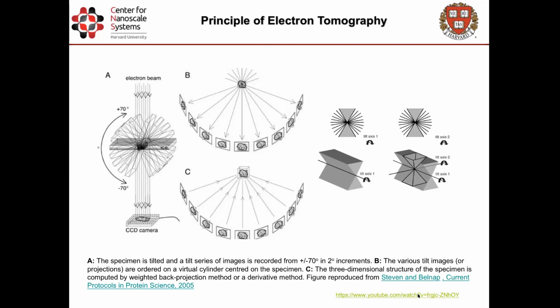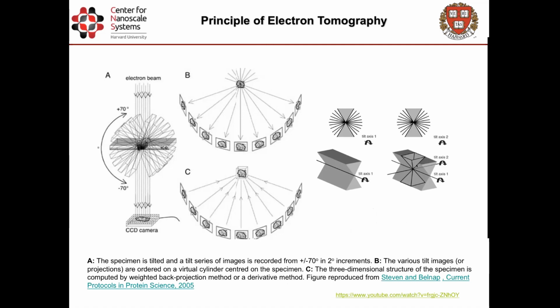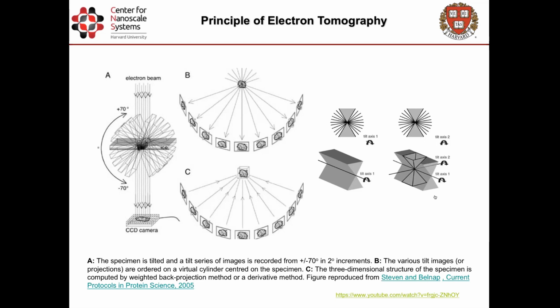This is from the Diamond Light Source, which is pretty much the synchrotron in the UK, in Oxfordshire. It's a comparison here to the SLAC in Stanford, and it tells you how cryo-electron tomography works, and everybody agrees that this will be the next revolution in cryo-EM. But for the moment, we do need to get very thin cryo-lamellae in Cryo-FIB to be able to collect this quality of data. And if you go to this YouTube link, you can load all this information. You have tons and tons of cryo-EM presentations. I'm going now to have a look at the question.